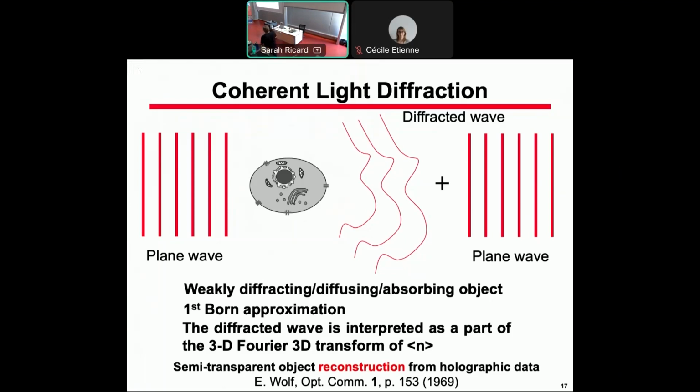So you understand why this paper was forgotten in 1969: you have to make a 3D Fourier transform. You can look at the memory of computers in '69. Then no lasers, or almost no lasers at that time, and no CCD. So okay, just forgotten. And the revival of the topic was in the 80s, when cameras were available, lasers were available, and computers were more or less working. But basically the trick is there, it's just 3D.